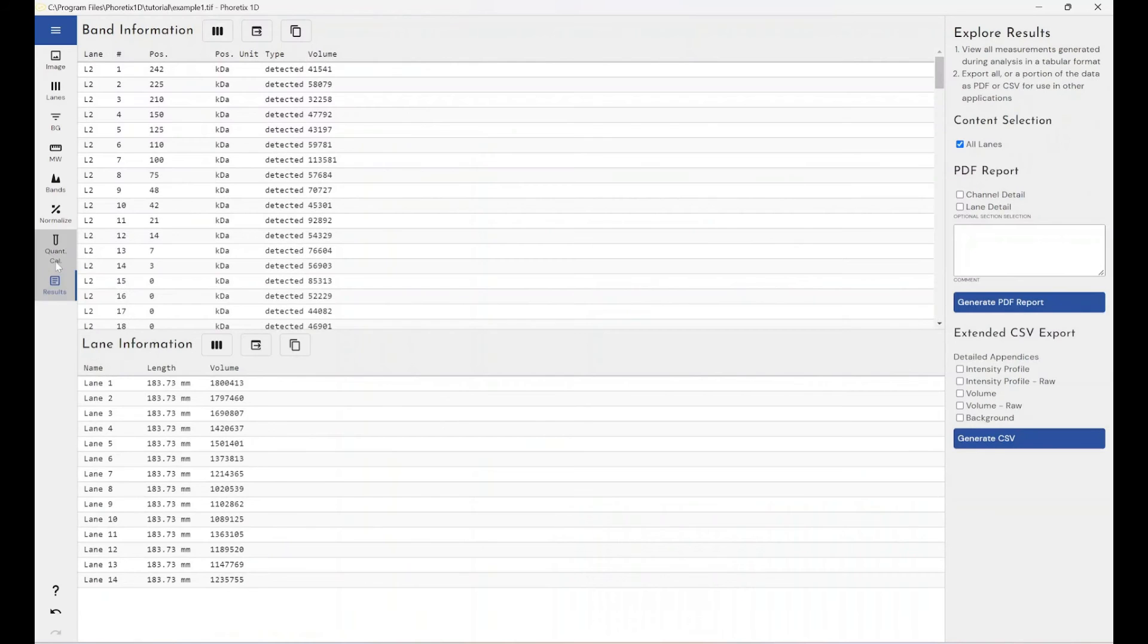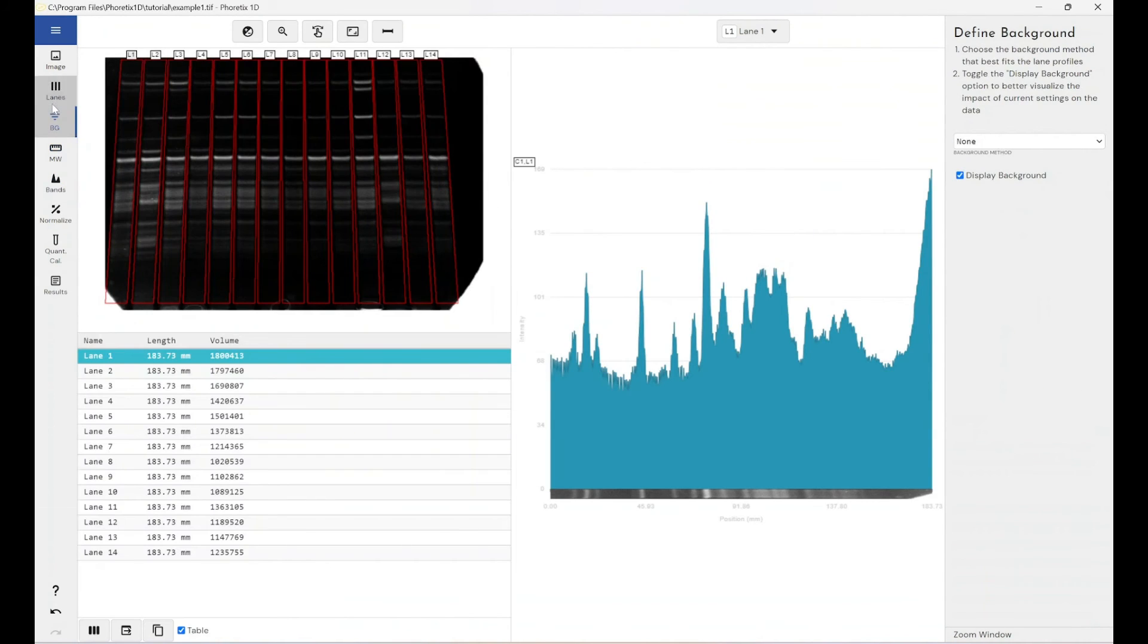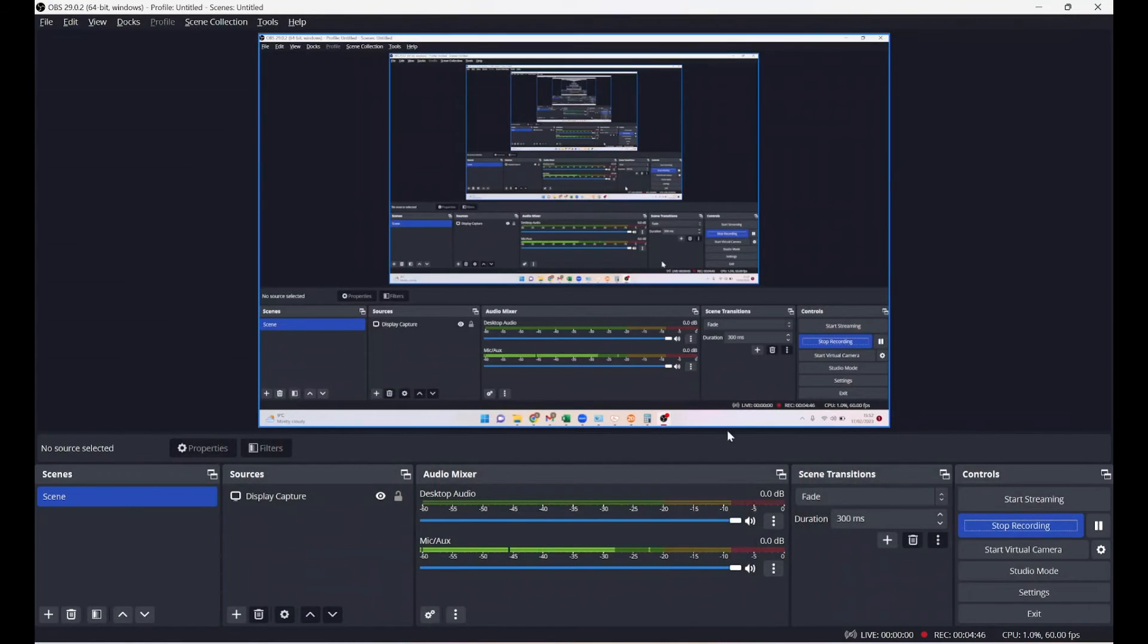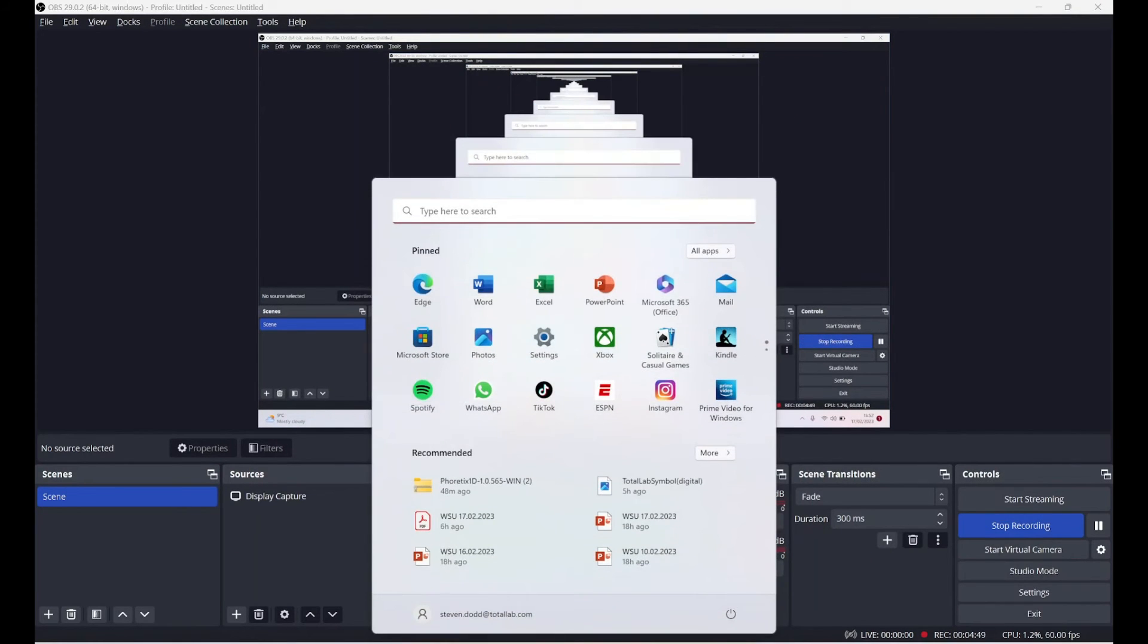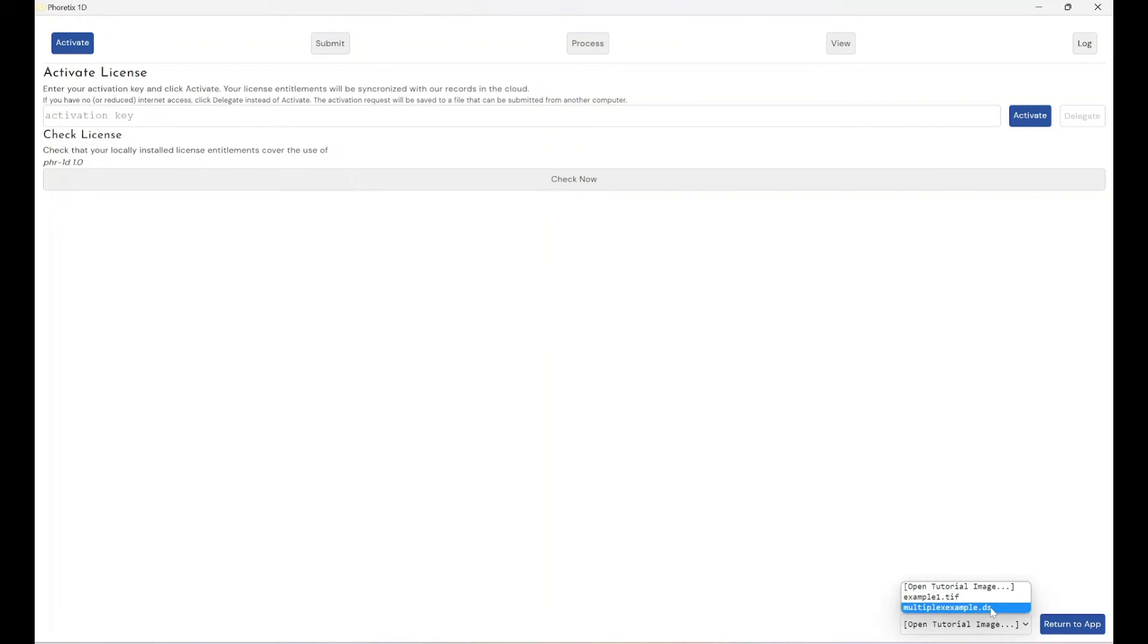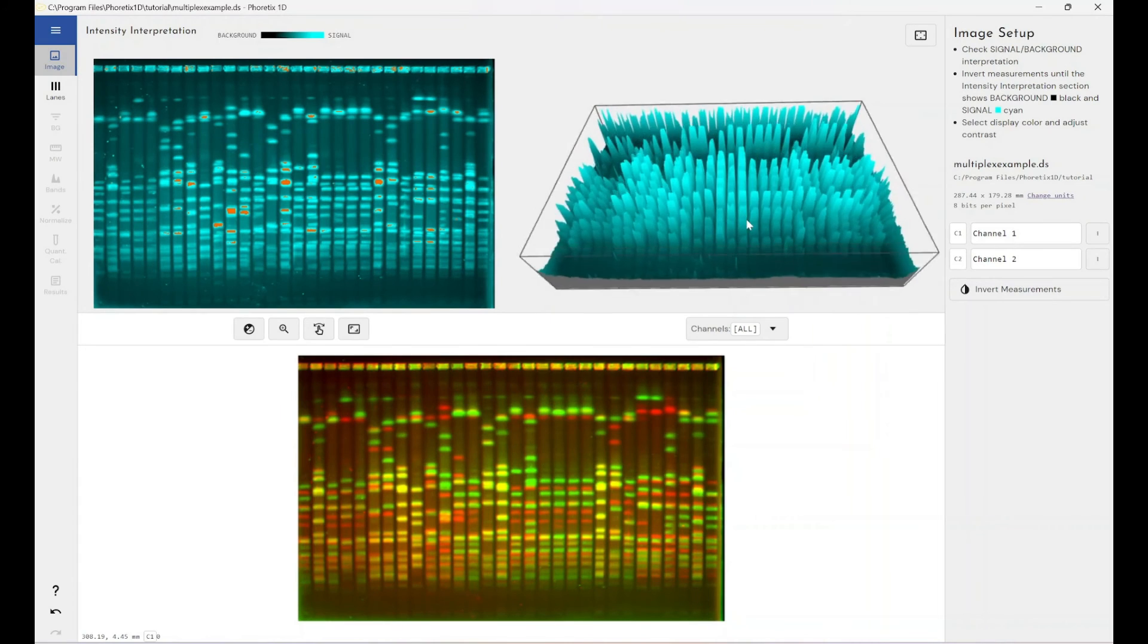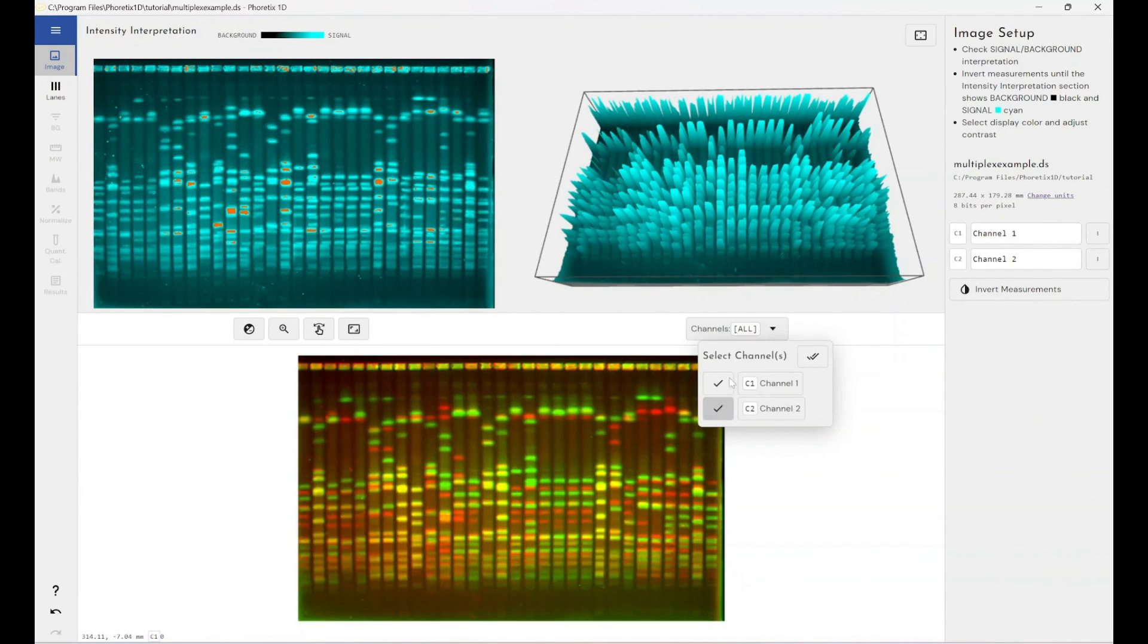So if you want, I'll run through the multi-channel image as well. So if I wanted to come off this mode, so if I go back into trying to launch Phoretics 1D in an unlicensed state, and if I click the drop down and open the multiplex example, again, here we get a multiplexed image example. And you can run through the software showing students how you would handle multi-channel images within the software.